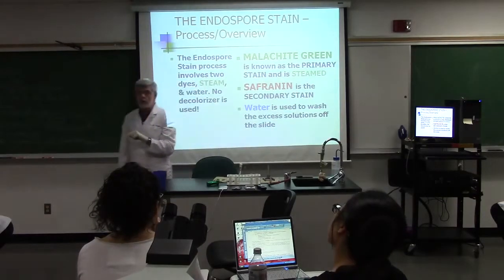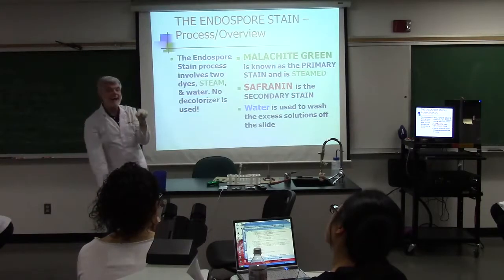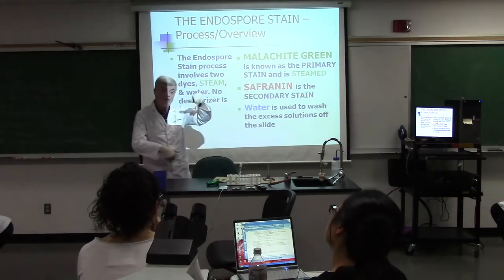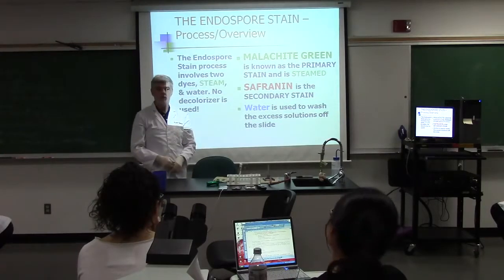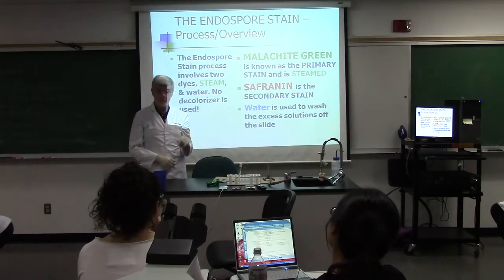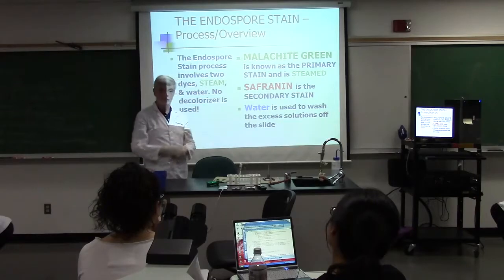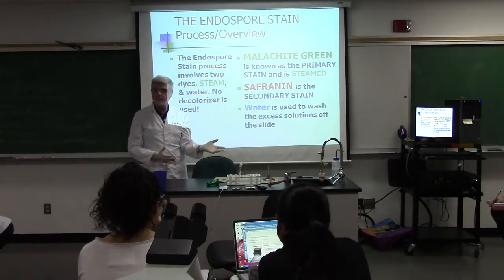And when you're doing the alcohol, I don't want 3 drops. I want a quarter to a half of a dropper full. Squish! Let it run off, wash it. Why? Because this is too much time. Squish, wash. 1 drop, 2 drop, 3 drops, that's 4 seconds.